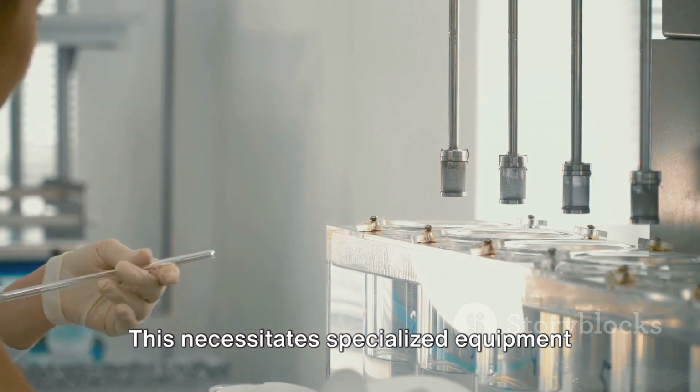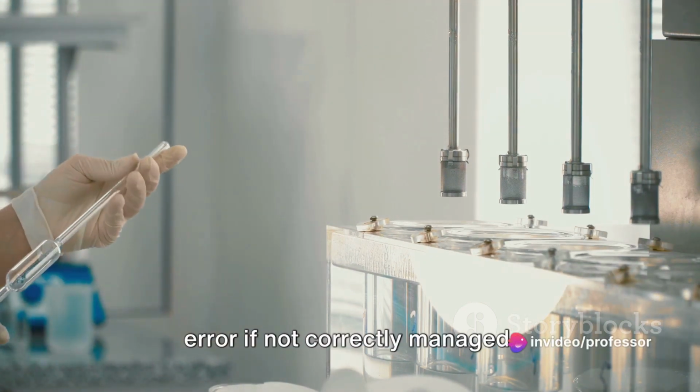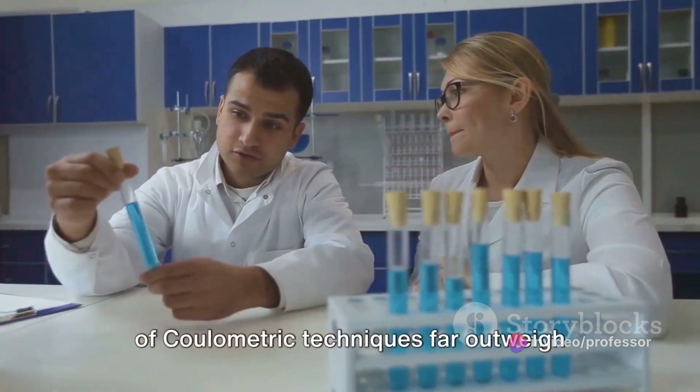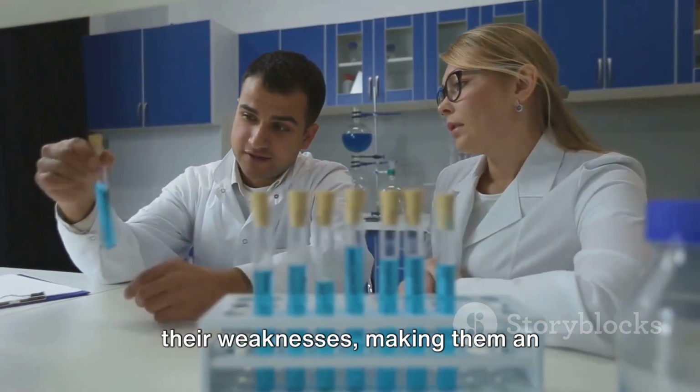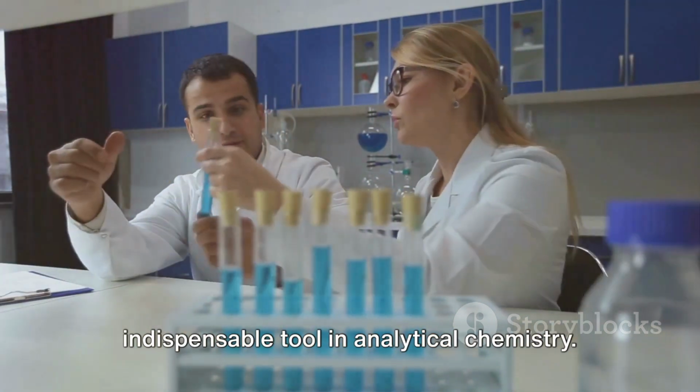Coulometric techniques also require a stable known current or potential to be maintained during the analysis. This necessitates specialized equipment and can introduce additional sources of error if not correctly managed. Despite these limitations, the strengths of coulometric techniques far outweigh their weaknesses, making them an indispensable tool in analytical chemistry.